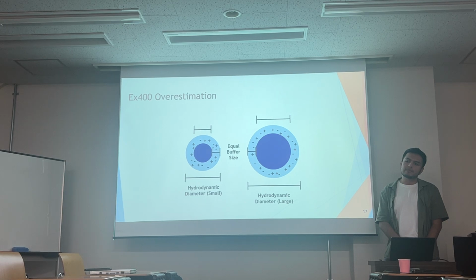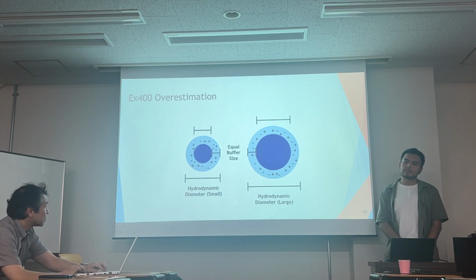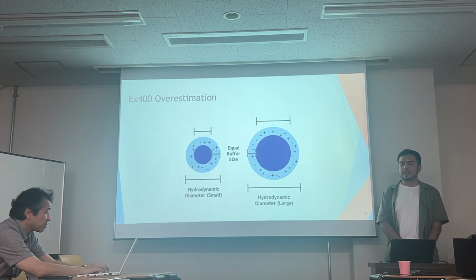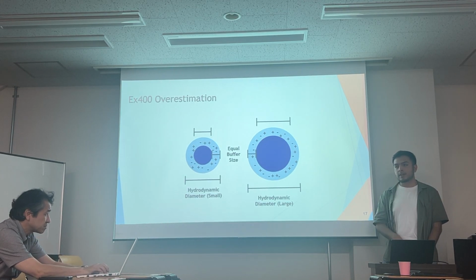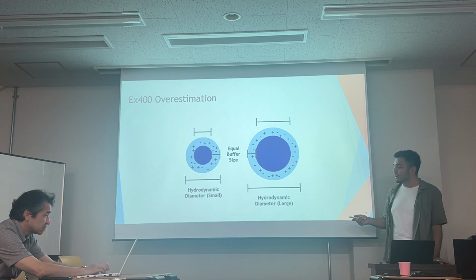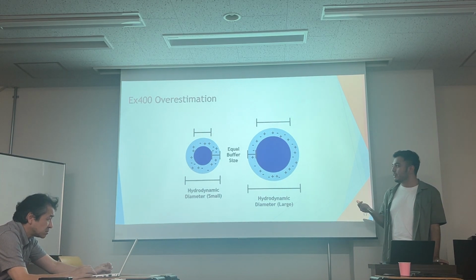And I think that is because of the solution. So if you change the solution, instead of water, using a different one. Oh, that's a really good question, actually. I do think that the buffer size would change. Hydrodynamic diameter is partially dependent on what medium you're dissolving your particles into.